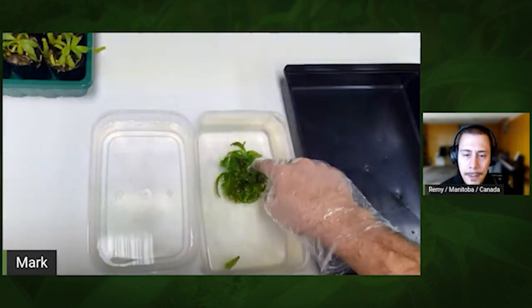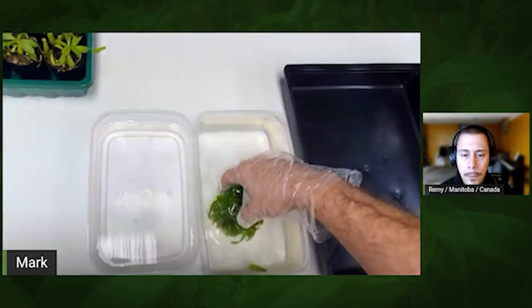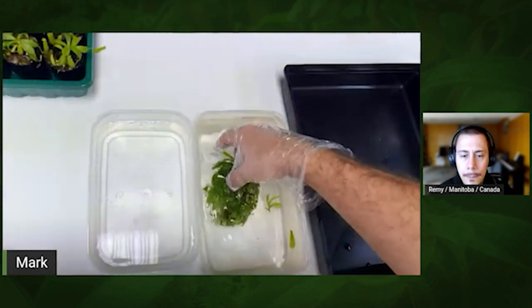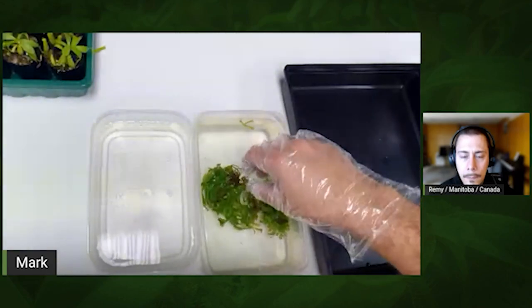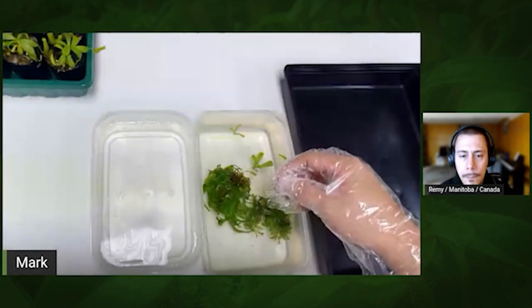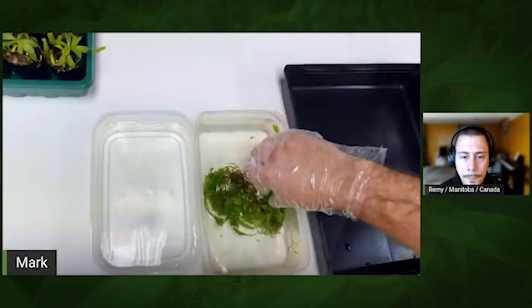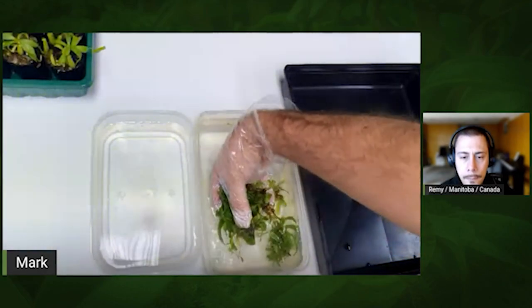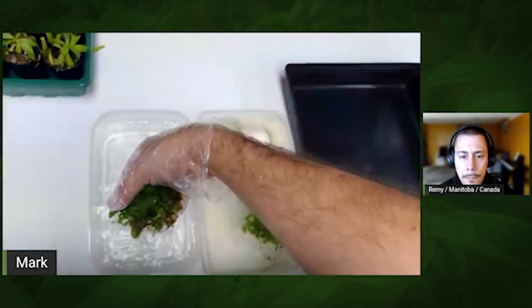The water is at room temperature — just room temperature. You could use slightly warmer water, which makes it easier to dissolve, but it's not very necessary. There are already so many breaking parts even being very gentle. I'll just shake a little bit to separate them. The reason I have two containers is that when I drop the flask in, a lot of gel drops with the plants, and I don't need that. I need only the plants free from all that material.